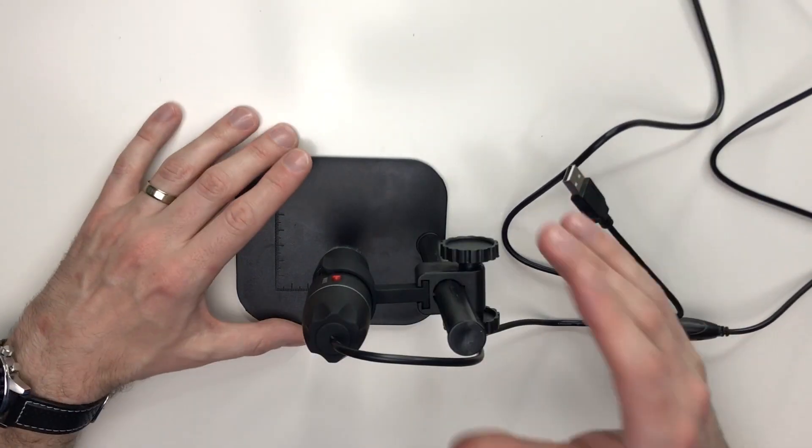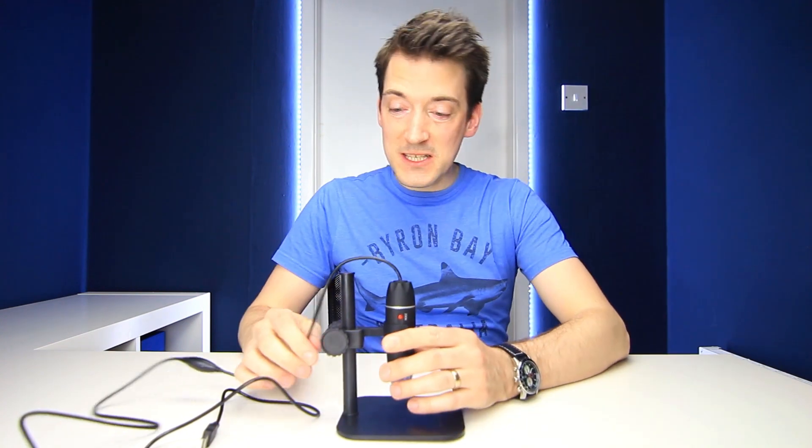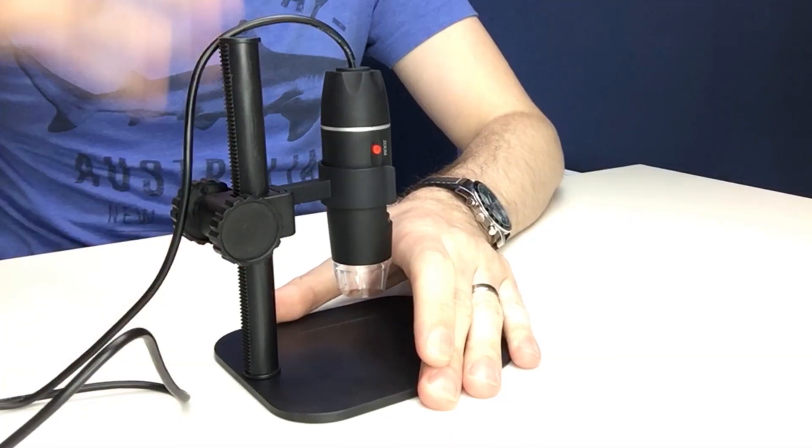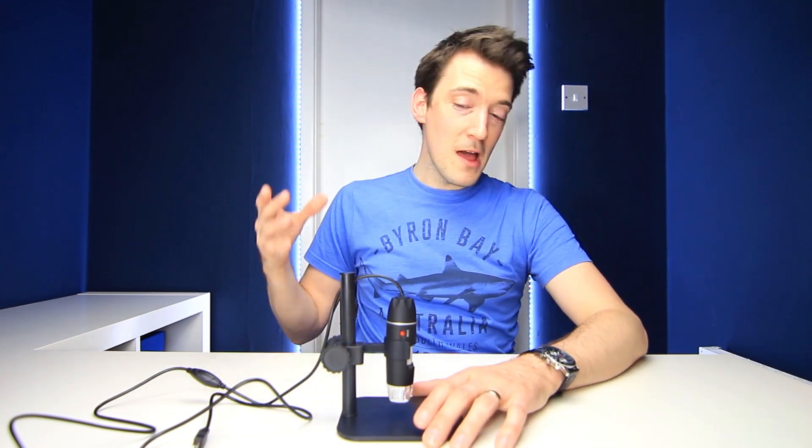The most frustrating thing is the robustness of this. The design itself is quite solid, but when you're trying to move it around, take a snapshot, or even just adjust the focus, it's just all over the place. Overall however, it's fantastic — it really is. It's cheap, it's cheerful, and if you want to throw this in someone's stocking as a filler or a small birthday present, especially if they've got a scientific mind, they are going to love it and be blown away.